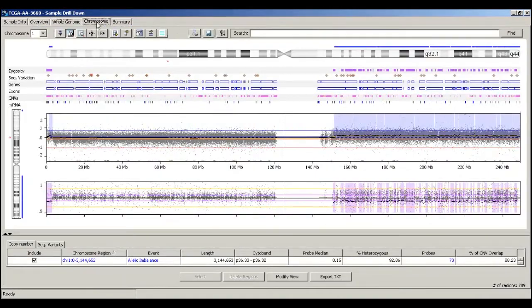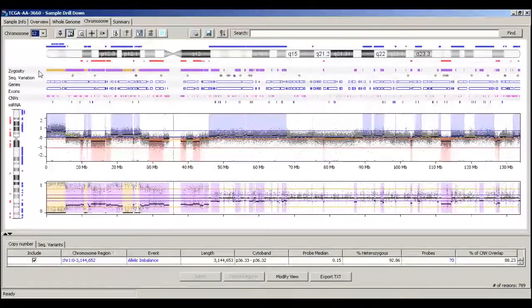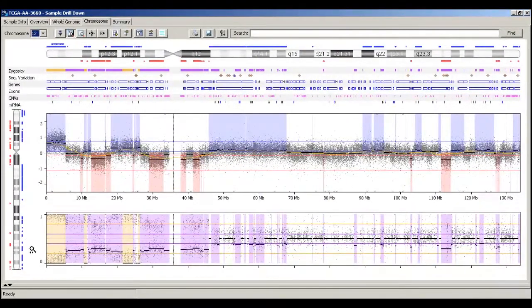So we can zoom in to chromosome 12 and look at this a little bit further. And I'm going to hide the table right here, so now we can just view chromosome 12. And what you can see is that we do in fact see this flip-flopping of copy number states from gain to loss throughout the chromosome. Looks like there's a good number of changes here, which typically defines chromothripsis. We see that in the lower states we do have loss of heterozygosity, which is good. So this might be an example of a chromothriptic event. And again, this is interesting just for general knowledge, but also because chromothripsis has been observed at a low frequency in many different tumor types, and it may have some implications with survival.